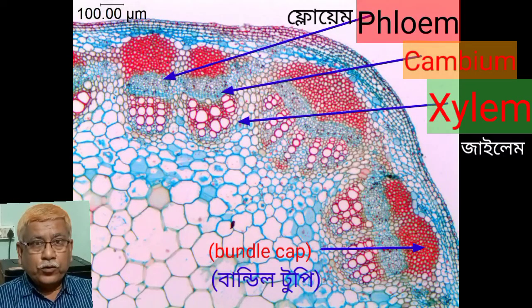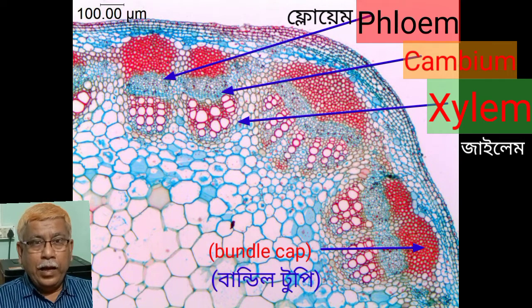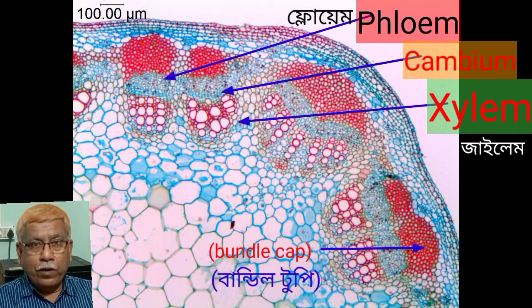Vascular bundles are conjoint, collateral, endarch, and open. They are arranged in the form of a ring around the pith.